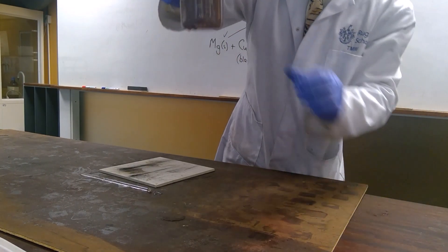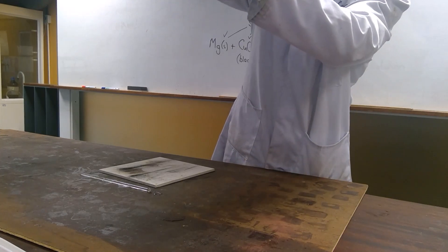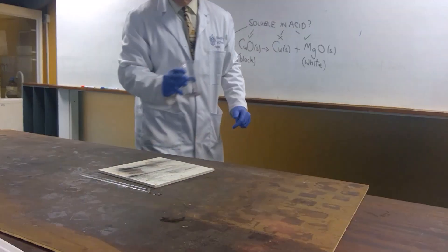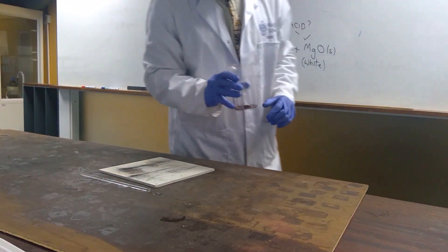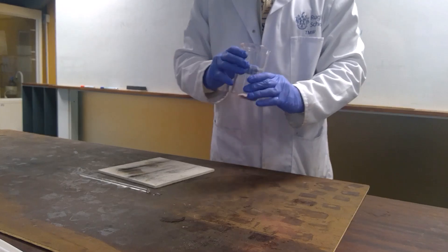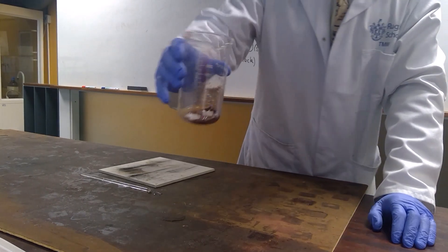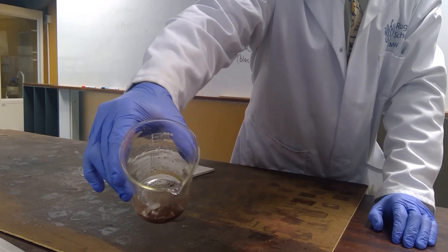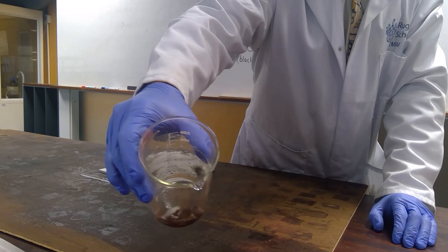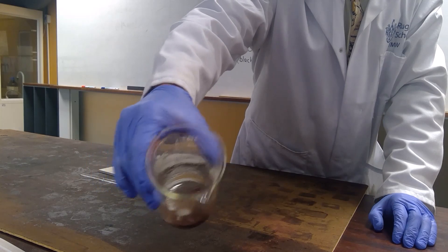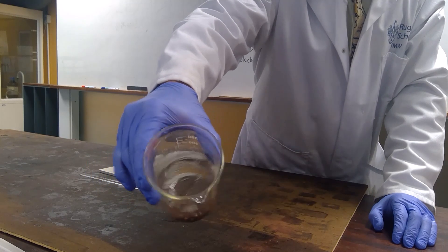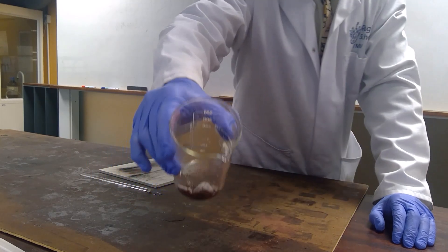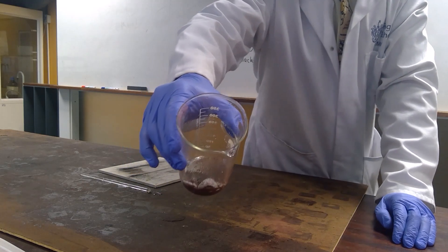That may become more clear as it settles. There are distinct signs of the reddish-brown colour of copper that is present in the crucible parts.